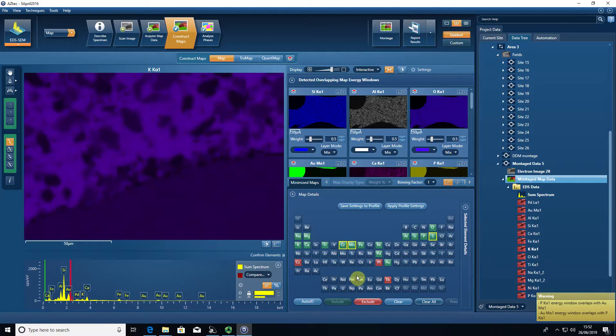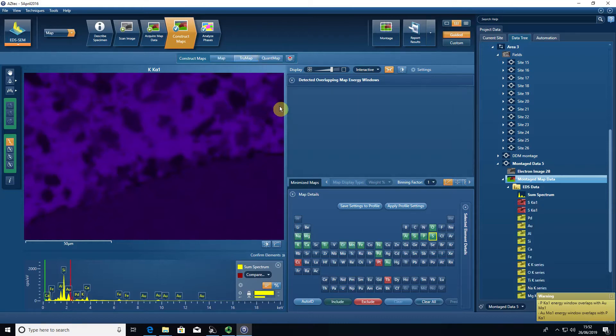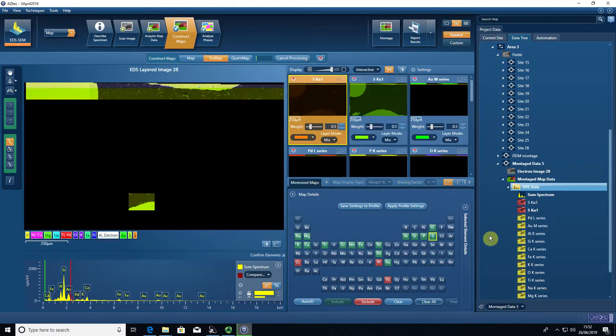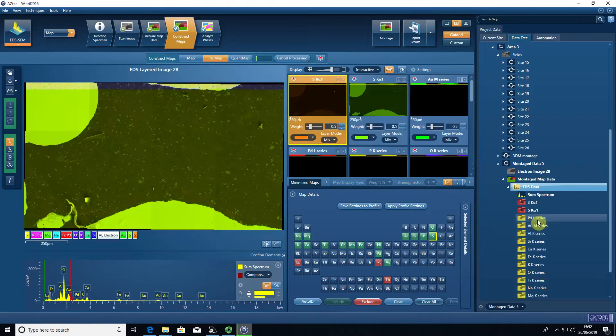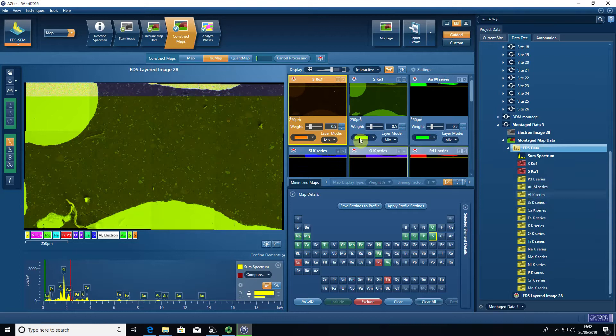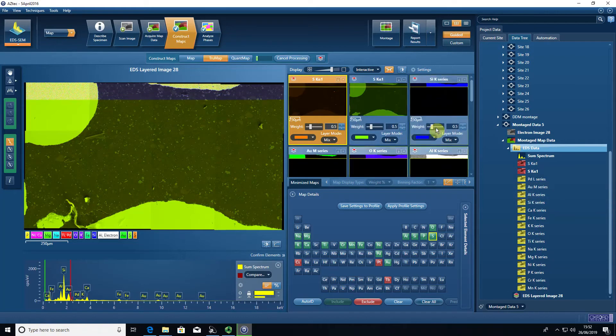Once you're happy with the element list that you have selected, then what we need to do is to press true map. And by pressing true map, the data changes from red to yellow. You can see the data is now processing as it goes.